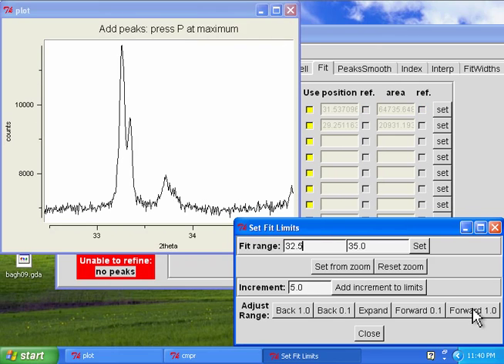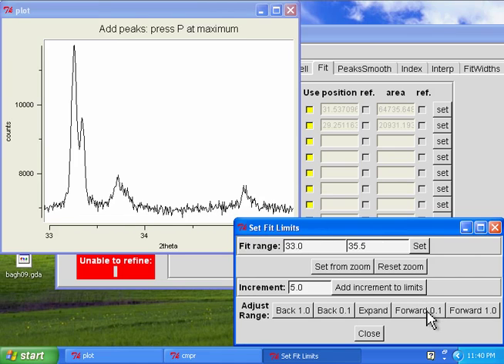And here, actually let's go a little bit more, since it looks like there's another peak. There, we've got 3 peaks now here. Now one thing you'll notice is that this looks very sharp compared to what we've seen before. That could be a sign of, well, first of all, could there be an extra peak under here? I don't know. Probably not. This is probably K-alpha 1, K-alpha 2 splitting. But we'll find that out for sure when we try putting a peak here.